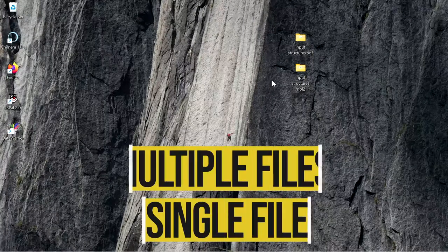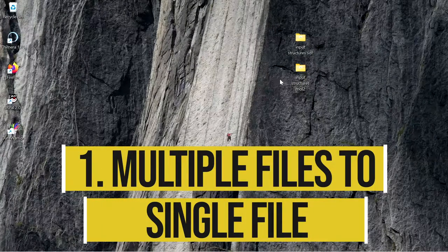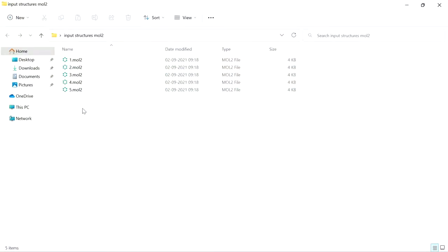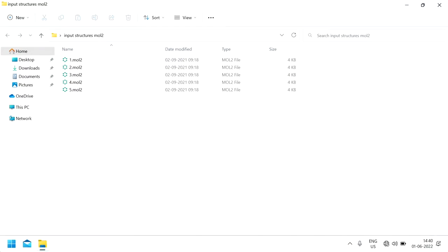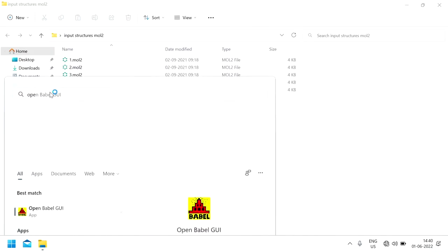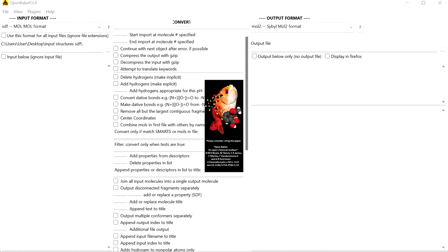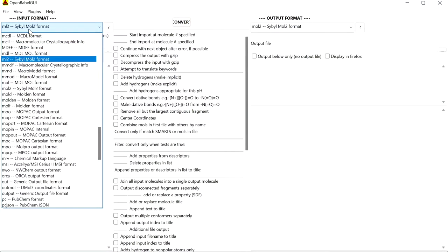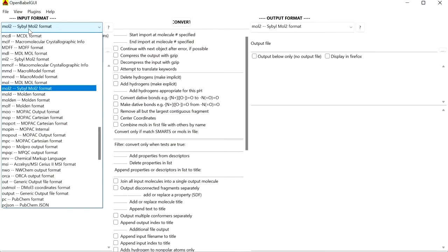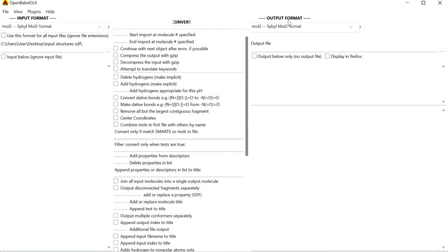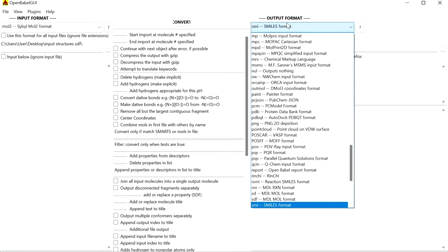For that we have a test folder here. In this folder we have five individual mol2 files. First we are going to convert these five molecules into a single sdf file. For that I am going to use Open Babel. First in Open Babel, select the input format and output format. I have selected mol2 as input and sdf as output format.